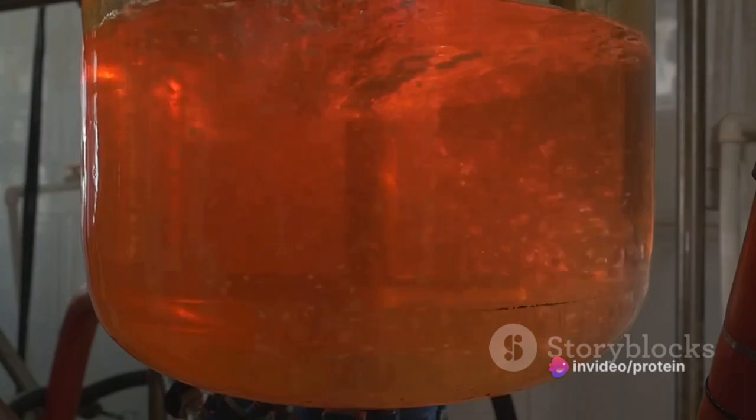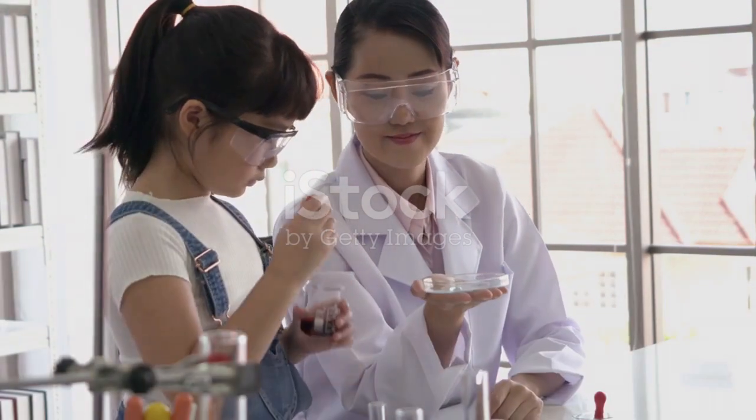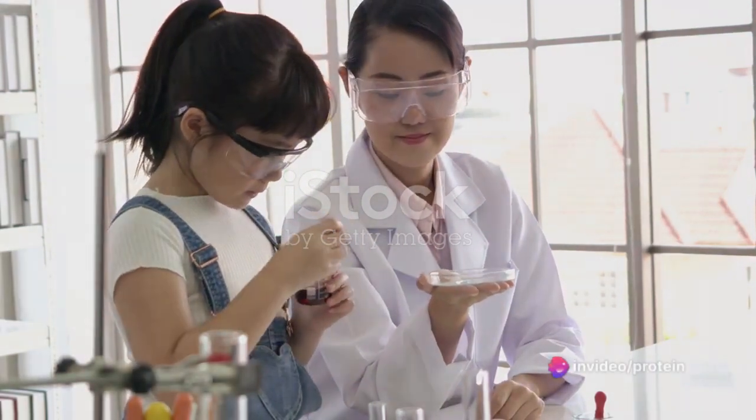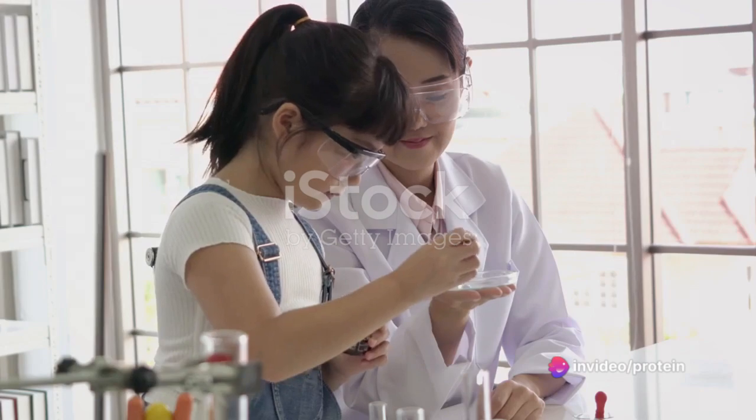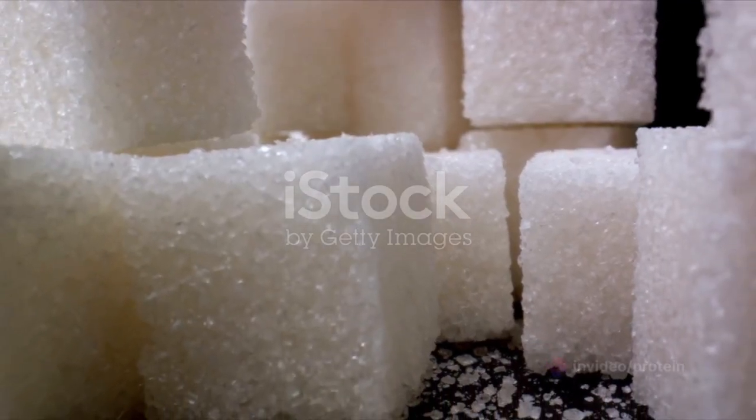But do you know what happens when it reacts with sulfuric acid? This experiment will reveal the fascinating chemical reaction that occurs, and it all begins with a simple step. Take a sugar cube, pure sucrose, and place it in a petri dish. The sugar cube represents the substance we're studying, sucrose.